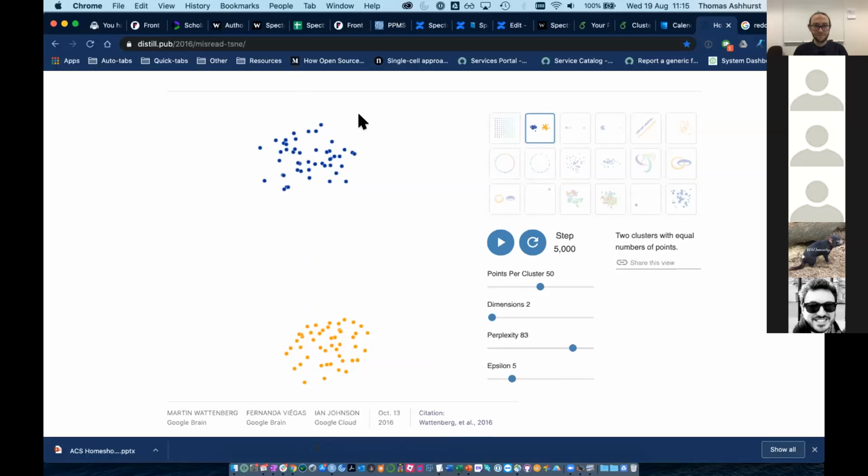But that kind of highlights the fact that this is a data-driven process, and the interpretation of that needs to relate to something biological. And there's this great story in different contexts where it's like, well, I found a novel cluster, and that's fine. A novel cluster is something to be excited about, but when does a cluster become a population? To do that, we essentially need to, ideally, find a way to sort those cells, take them out of a system, put them in culture, see what they do, other kinds of studies to figure out, is this biologically something different to what it was before?